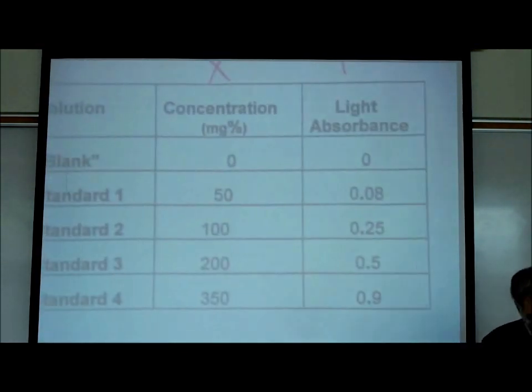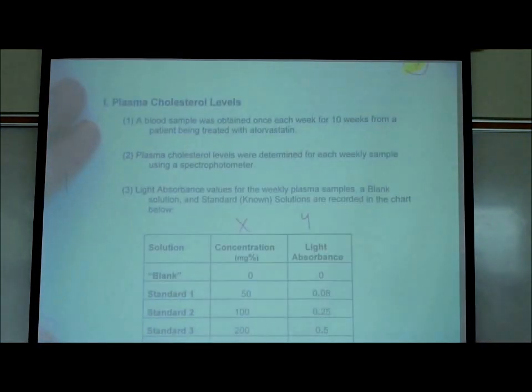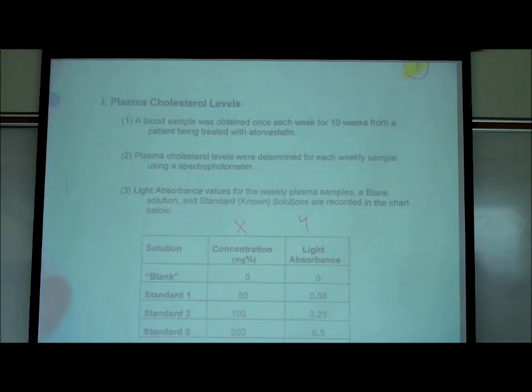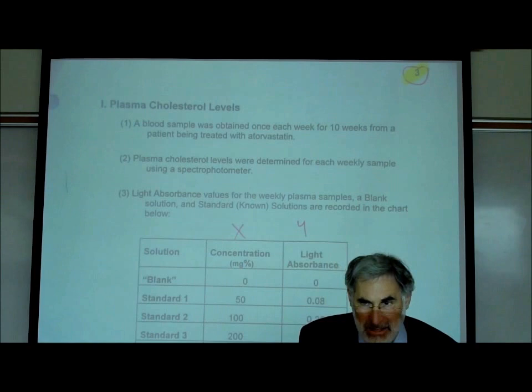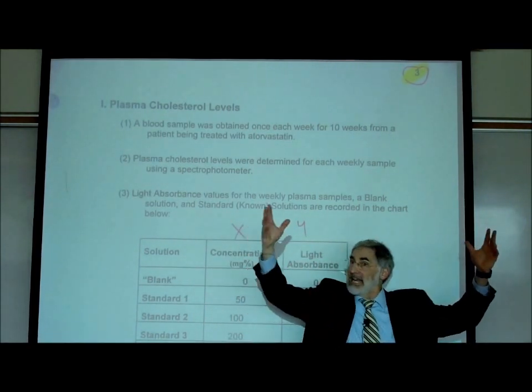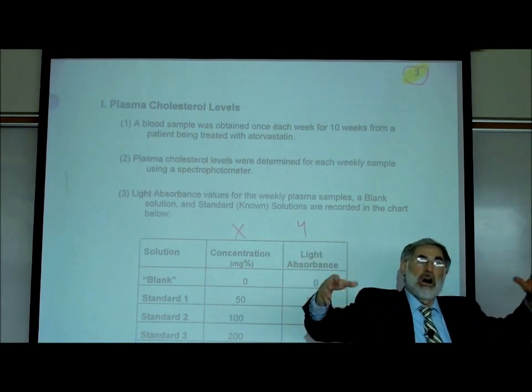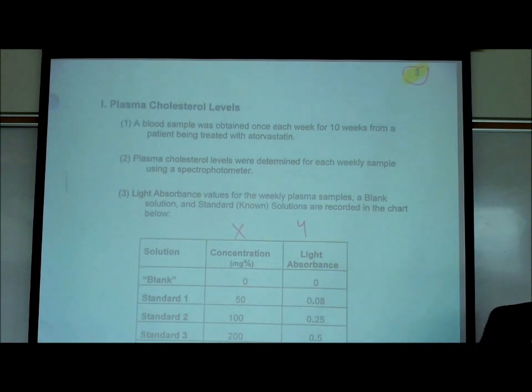Okay, so let's see what you're actually going to be doing. On page 3, you're going to be following these directions. All that I tried to do is take this concept of spectrophotometry, which you would learn about in any physiology class, and create a lab exercise involving this concept in a very clinical way. Because this is exactly what happens all the time.